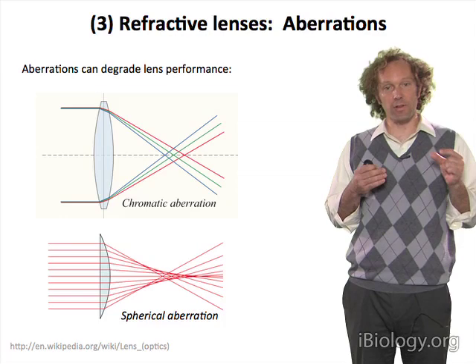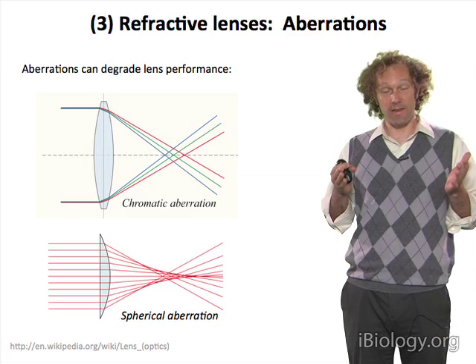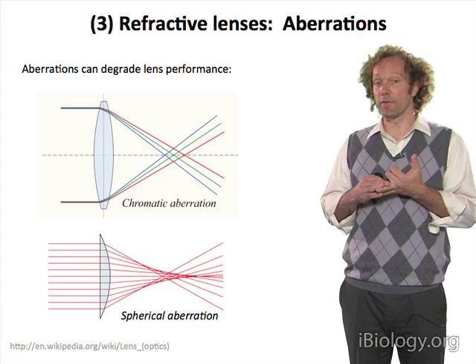But for large focal lengths, spheres tend to do a very good job, and spherical aberration is not as bad. And so again, the concepts of thin lenses, where we only care about the index and the radius of curvature, those concepts are still useful in thinking about how imaging systems work.